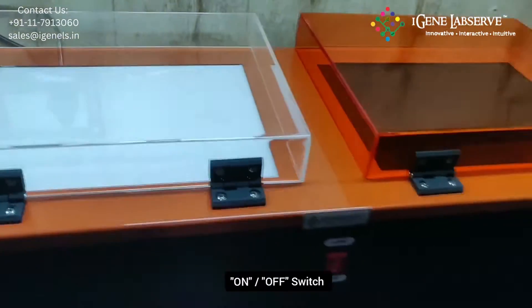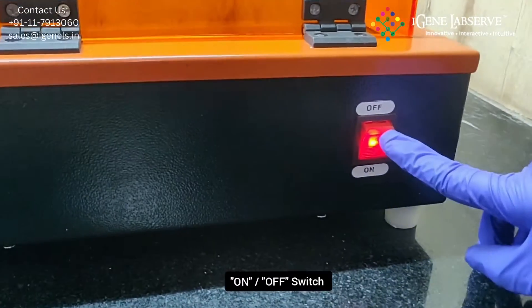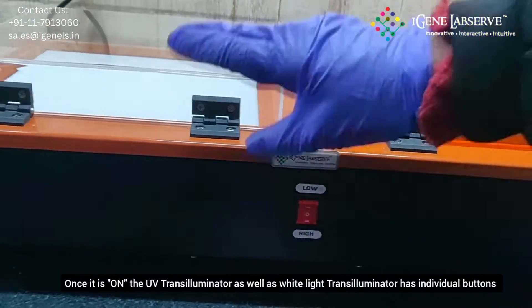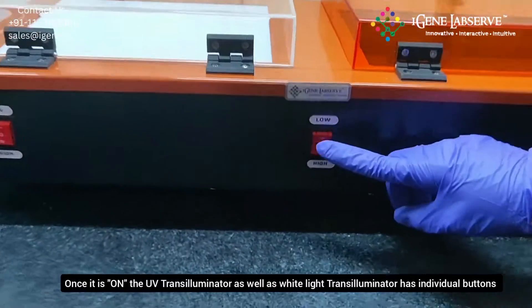It has an on/off switch to turn the unit on. Once it is on, the UV transilluminator as well as the white light transilluminator has individual buttons for turning on the light.